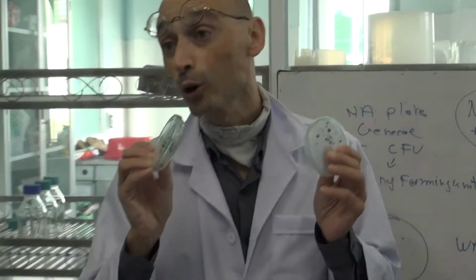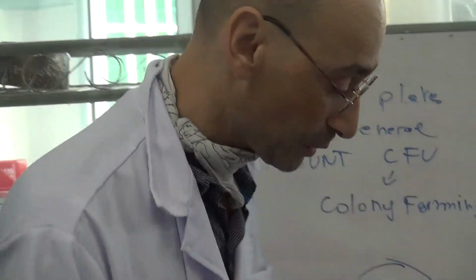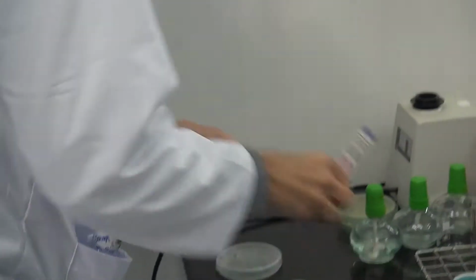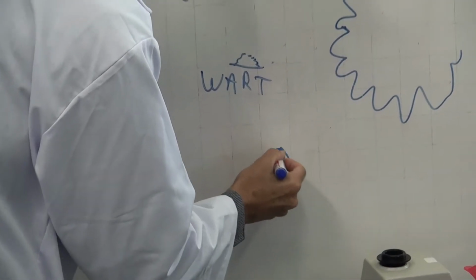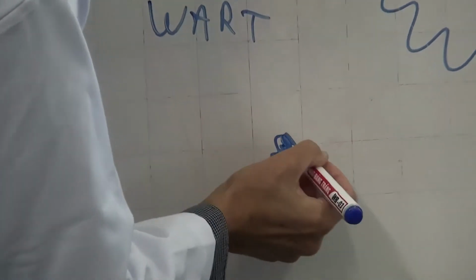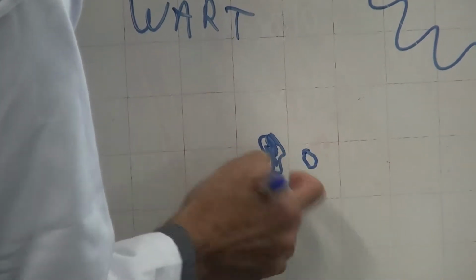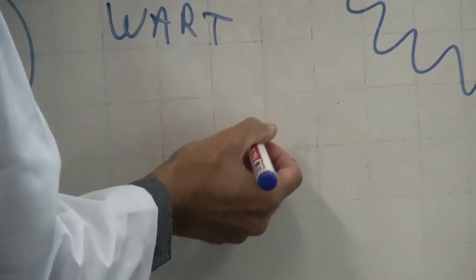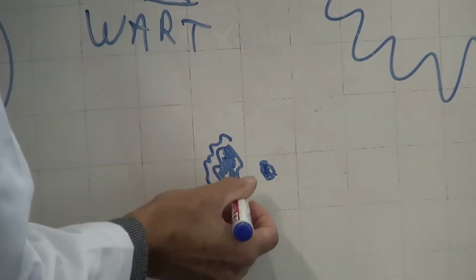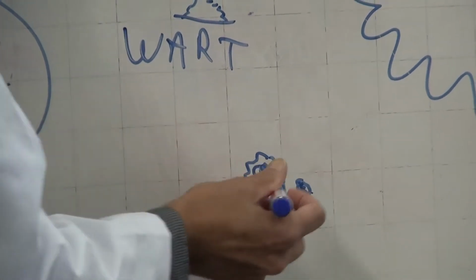And you should just look. It's difficult, it's not everywhere, but you're looking for something in which you have this clump of soil. So you're looking around, and you should see whether you're looking at the soil, and this is a dark brown colony. Or around the soil, you should see some smear, in which you also see some dark brown. And this could be Azotobacter.